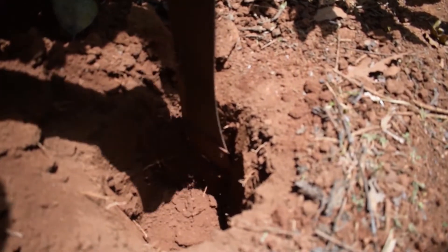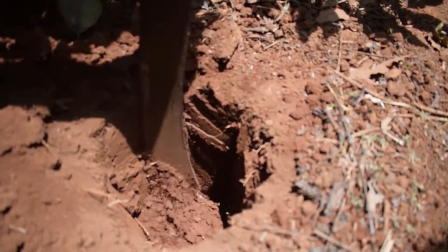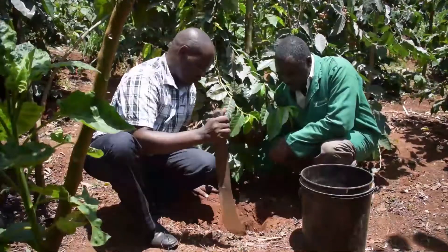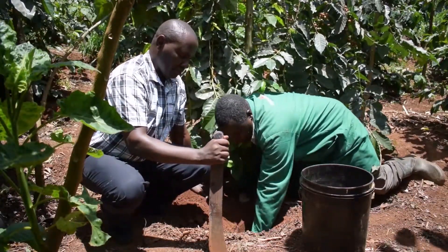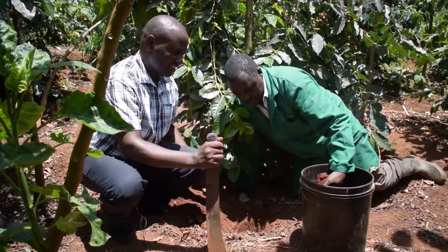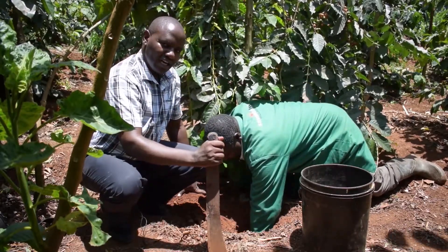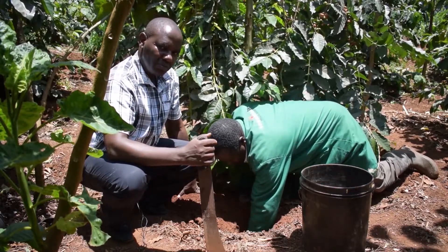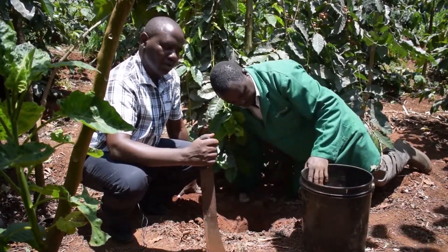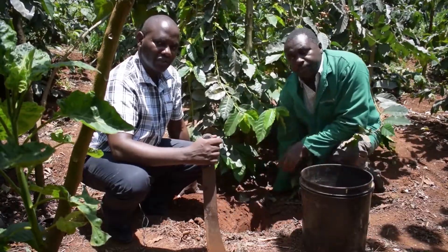Now we are going to slice on the side of this hole from top to the bottom, and this is what will make our first sample to take to the laboratory. We take the soil from all the other holes and mix them thoroughly to make a composite sample that we will then take to the laboratory.